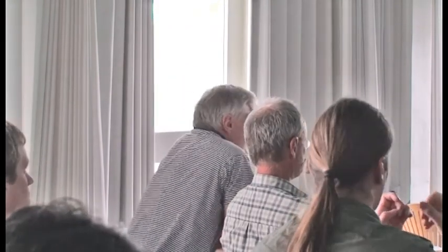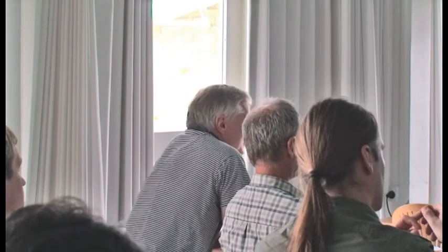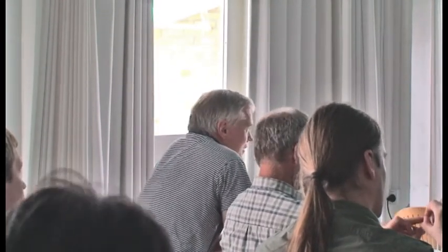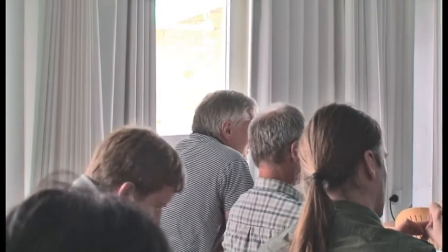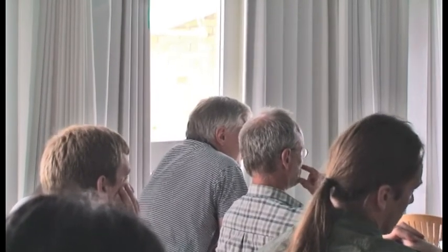I have a question, if I may. Yeah, sure. Have you considered doing a validation experiment, in the sense that you first look at your sample with the synchrotron, and then do FIB on it afterwards to see what the results are?